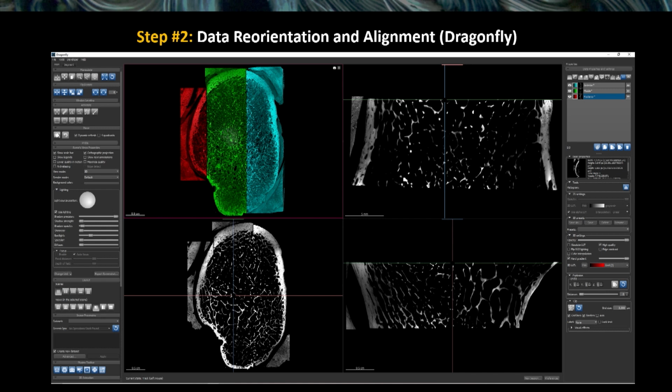Because I had to physically cut them into 3 pieces, I then needed to stick the pieces of the femoral neck back together. And so I couldn't just do this with a 3D model because I also needed to look at the grayscale values. Because if you orient something after you've binarized it, it's no longer binary because it's creating all of these intermediate grayscale values.